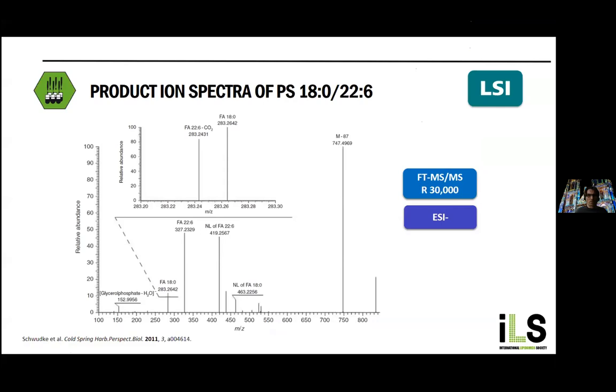So it is also nice to have high resolution for your tandem mass spectra.